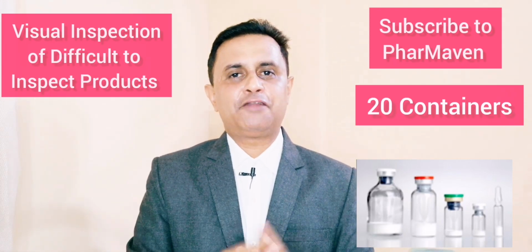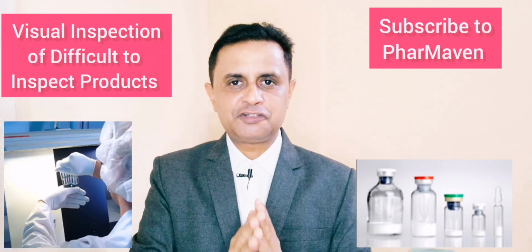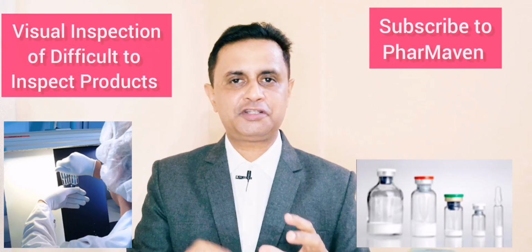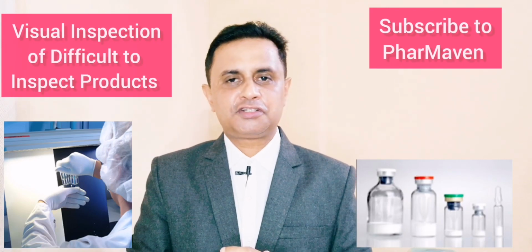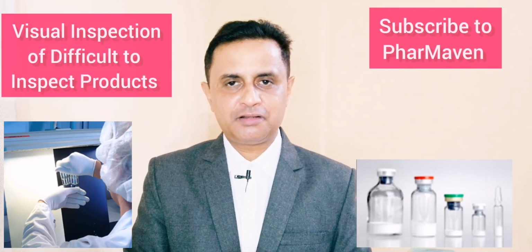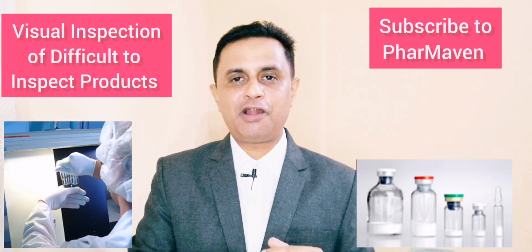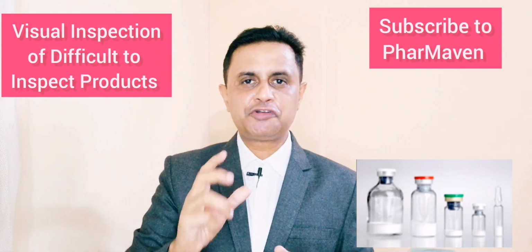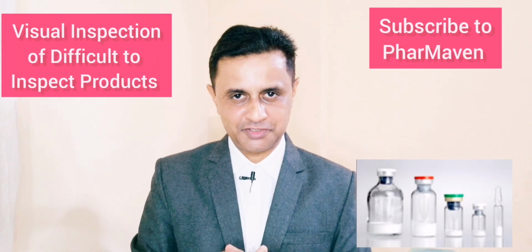Reconstitution should occur in an environment which will not introduce particles. If we are reconstituting in a grade C area or uncontrolled area, that reconstitution process will introduce particles and it will give a false result. So reconstitution should be done in a controlled environment, probably under LAF, so that it will not introduce particles to the container. Reconstitute and inspect as per the normal liquid injectable inspection procedure.